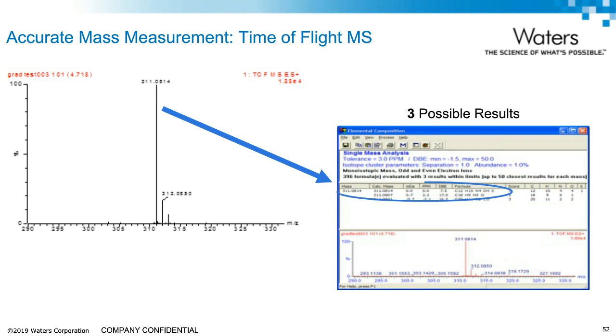Now, if we were working with an unknown compound, we would feel very comfortable saying that the peak is consistent with an elemental composition of C12H15N4O4S. But to know how these elements are connected within the molecule, we would need to perform other experiments, such as an MS-MS acquisition, to obtain even more information.